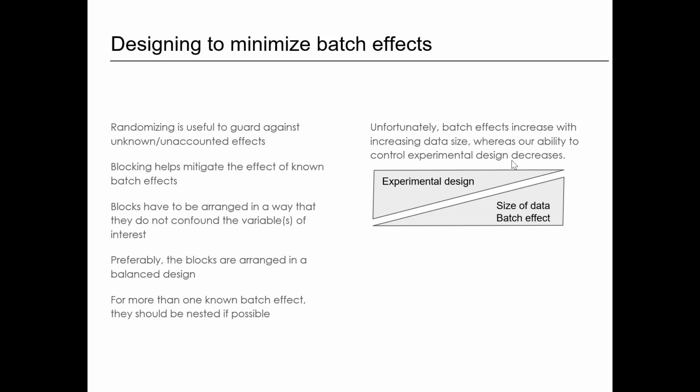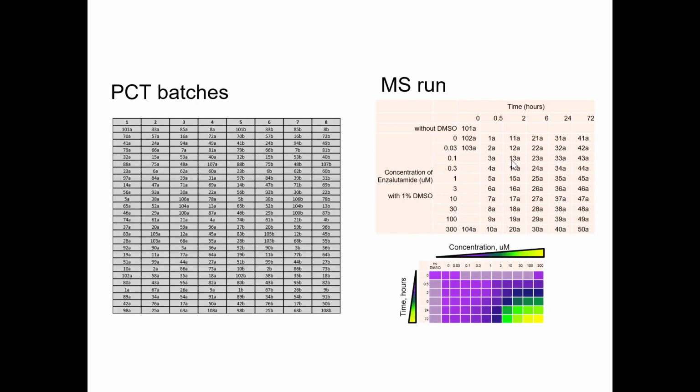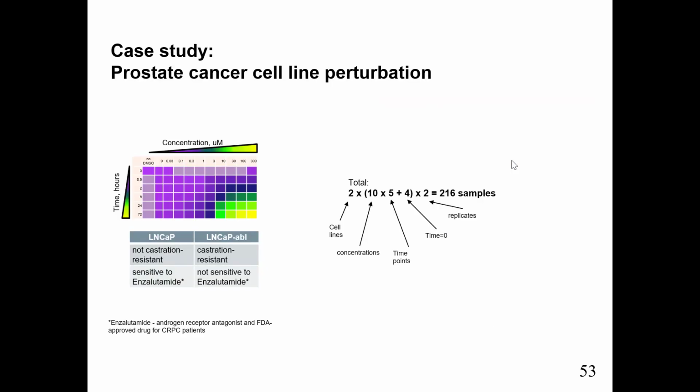Because we don't know what we should correct. So this has huge implications for experimental design. This will come up in the course of this module, and I don't want to spend a lot of time on that, but one of the important things here is to structure the samples throughout the analysis such that effects of batches can be recognized.